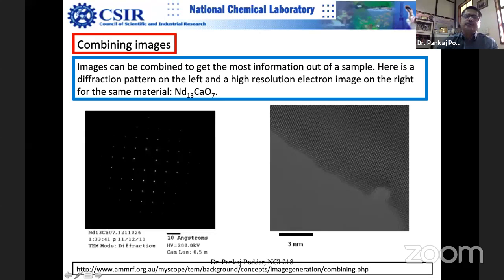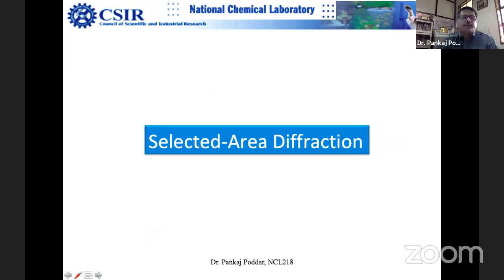Now you can do this for another spot, right? For example, you have selected another spot which you had masked earlier in the first round. So then you unmask that point, and then you do this, keep on doing. So you can basically look at the different d values, right? It becomes a very useful tool, actually. Any question so far?